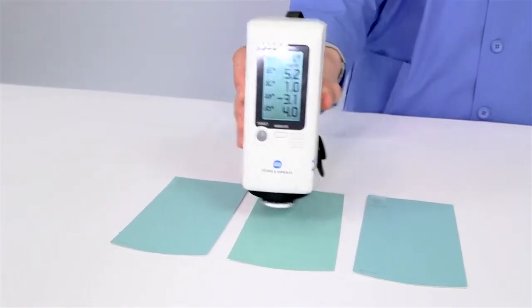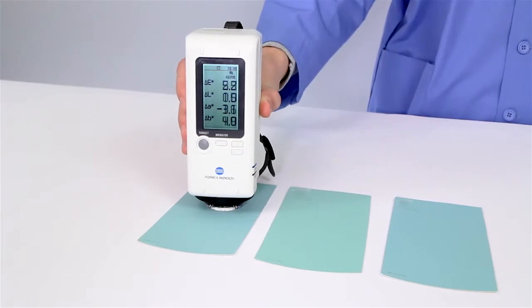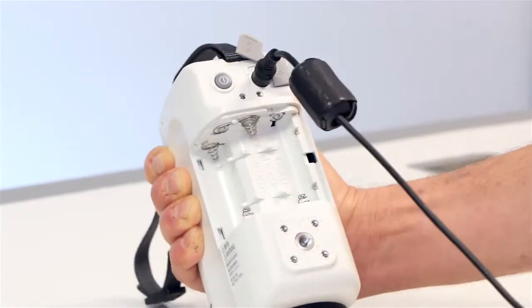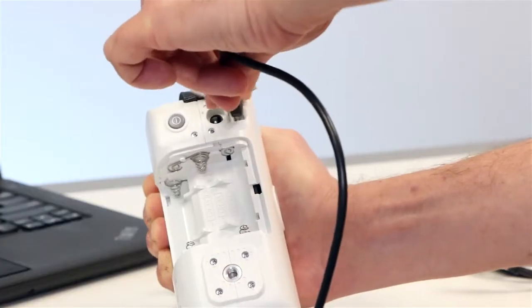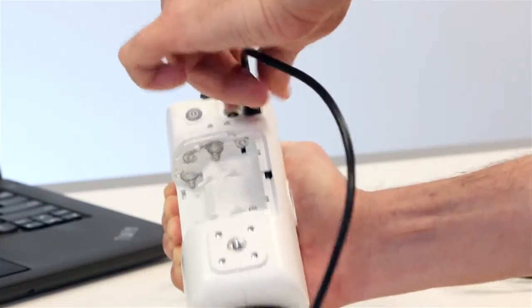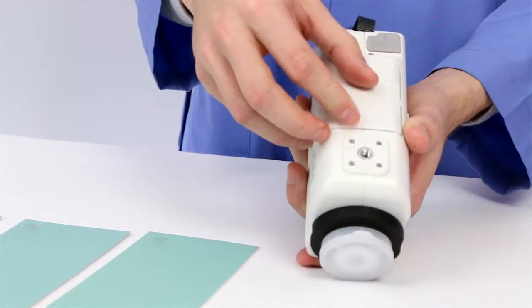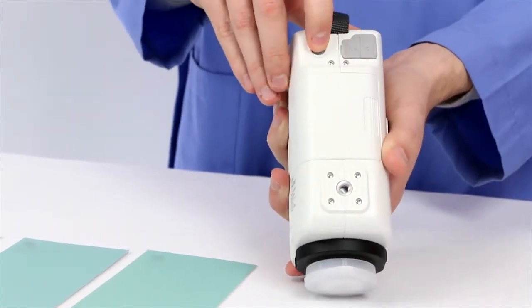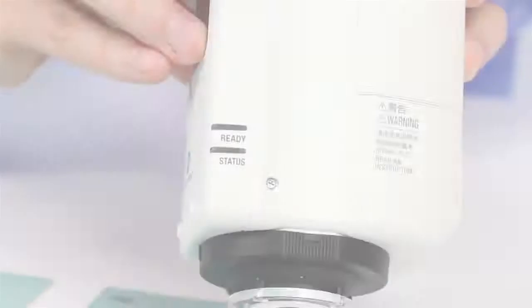You can also operate the CR-10 Plus with any one of three power sources, including an AC adapter, USB cable, or batteries. Ergonomic and lightweight design allows you to measure color difference with ease.